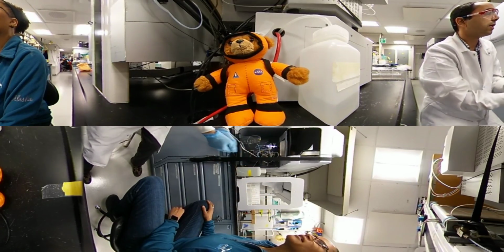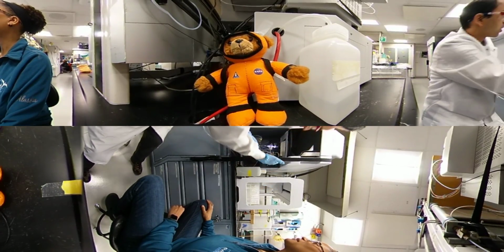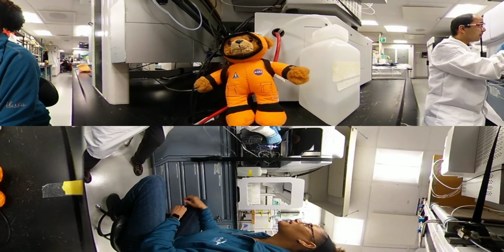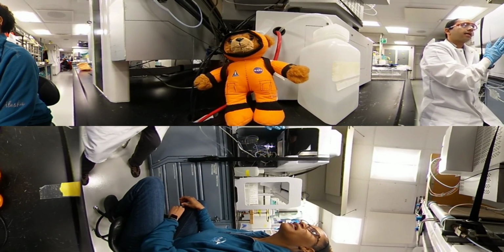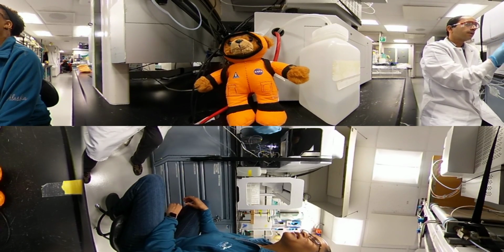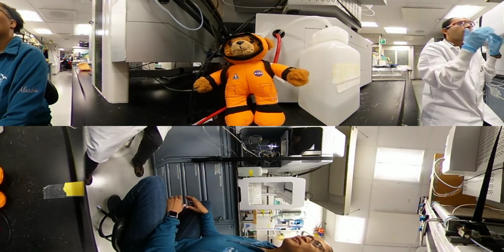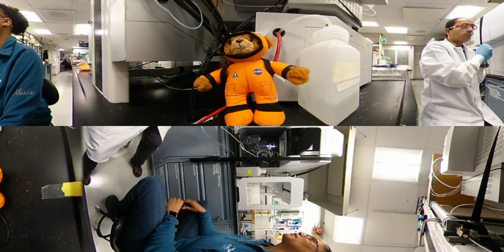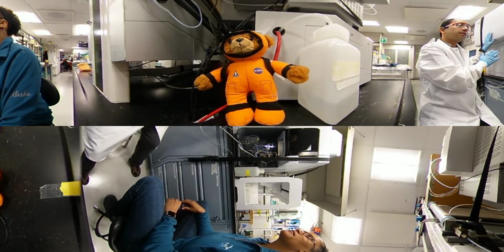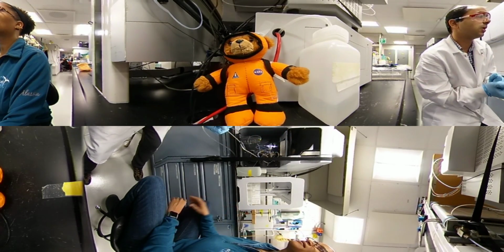which goes into each of these tubes at a regular interval and sucks the solution up, and then that solution goes through these complicated networks of tubings and eventually passes through the plasma where it acquires energy, and the atoms that are inside this liquid get ionized and go to an excited state. So when those atoms try to go back to the ground state, it emits some energy, and that's what the machine then measures. And that's how it goes into each of these tubes.